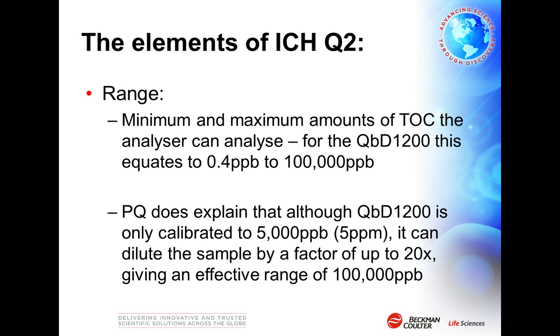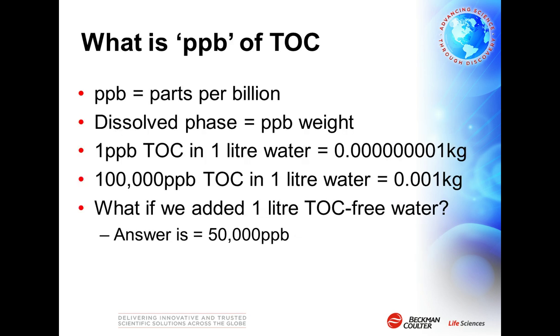Now, the range of the QBD 1200 is demonstrated by testing in the measurement range and then explaining that higher levels of TOC are analyzed through automatic sample dilution using a calibrated syringe pump accurate to plus or minus 1%.